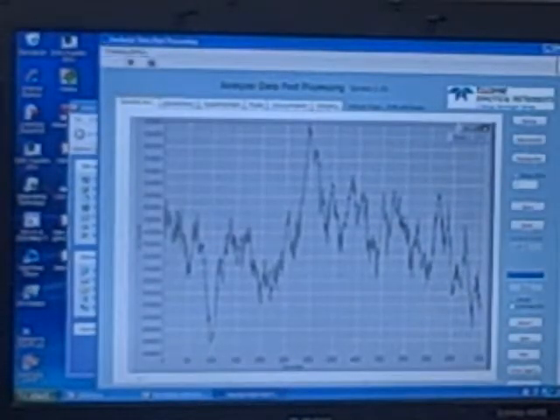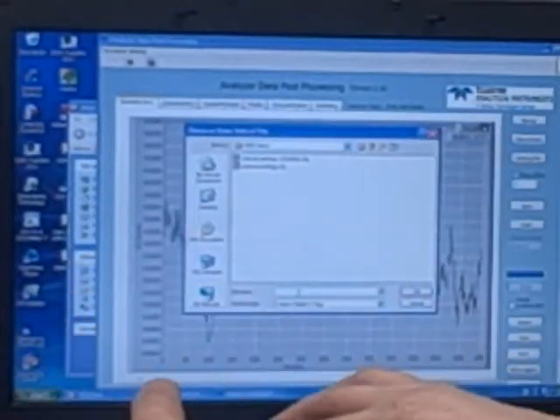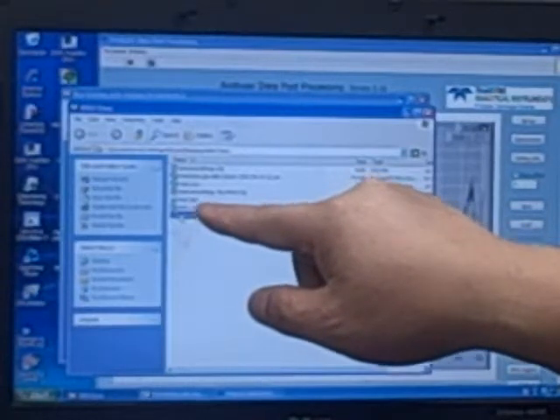In the meanwhile, if you can do additional work, go to parameter settings, internal settings. If you can save those settings into a file, such as, for example, test2, okay? And then you forward us the same settings, test2. So the best way is you send us both the raw data and the internal settings, emailed as an attachment. So we will open the attachment and look at the raw data file together with your settings files. We will have very good knowledge about the machine. Okay? Good luck. Thank you.